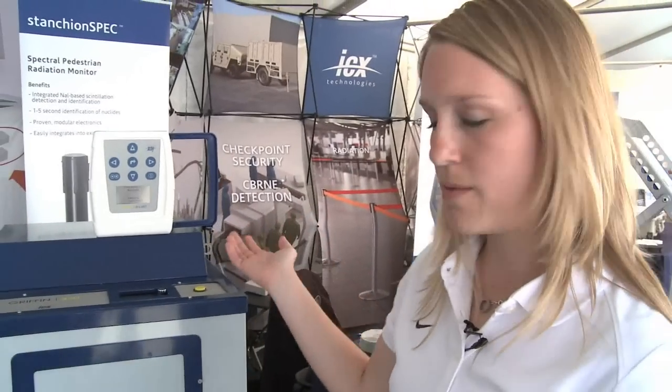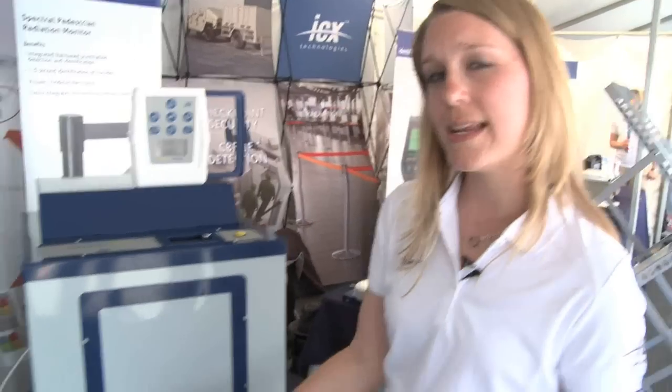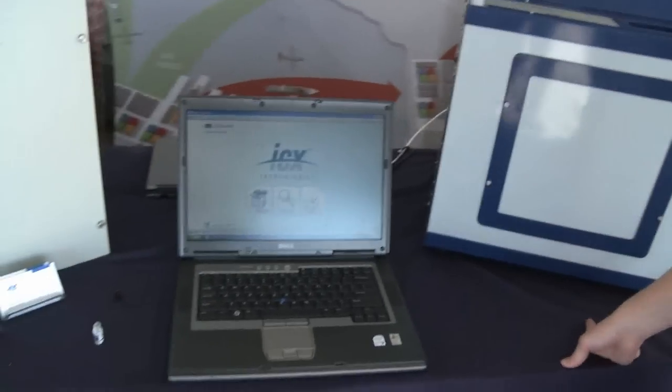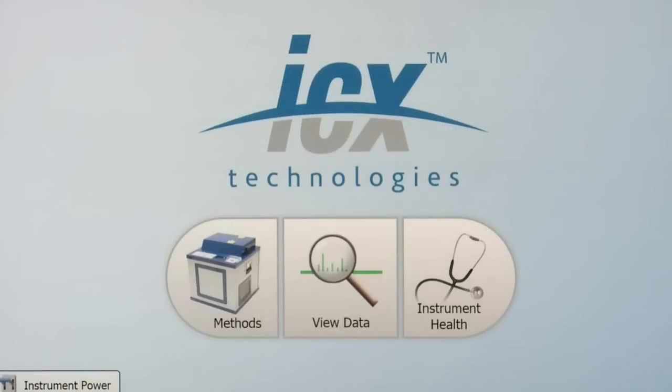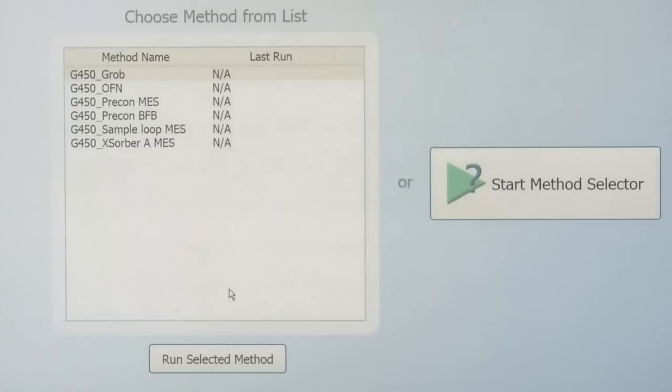Once you've docked your Xorber, you can select your method using the Griffin system software. Today we're using Level 1 software, which is a simplified user interface. I'm not quite sure what method to use, so I'm going to use the method selector. If you knew what method you wanted from your training, you could just select from the list.